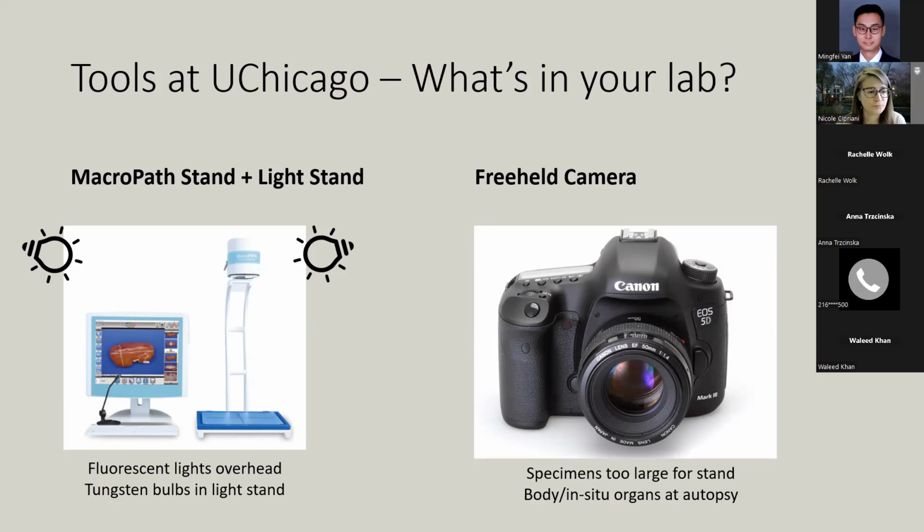We have handheld cameras. I think they're Canon as well. It's not this exact model. I think it's just a point and shoot. Okay. Is it mounted or do you hold it freehand? They hold it freehand. Okay.